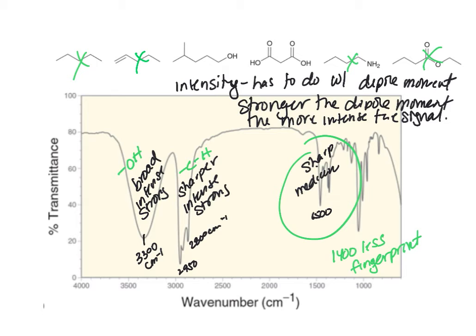So now we have to decide between the alcohol and the carboxylic acid. We can rule out the carboxylic acid because there is no stretch for that carbonyl. You'll see this in other spectra. You typically will have a very strong stretch between 1710 to 1680 wave numbers. It is a dead giveaway for having a carbonyl. So the only possibility would be this alcohol.